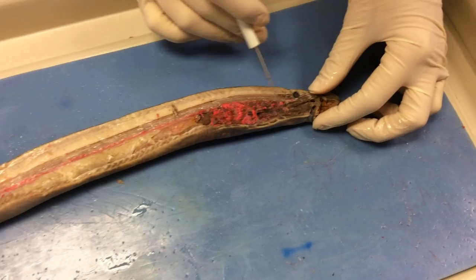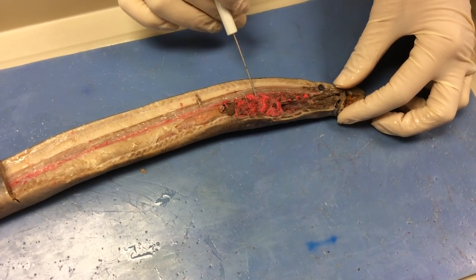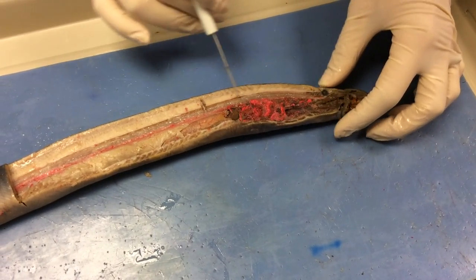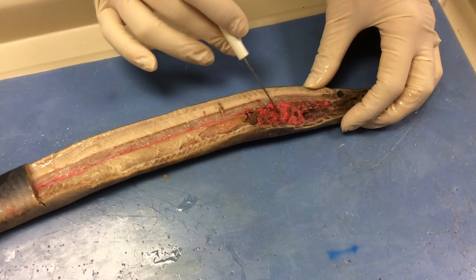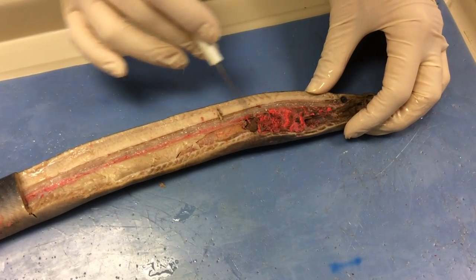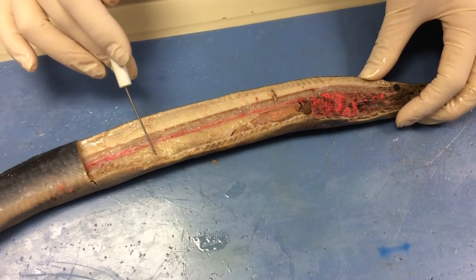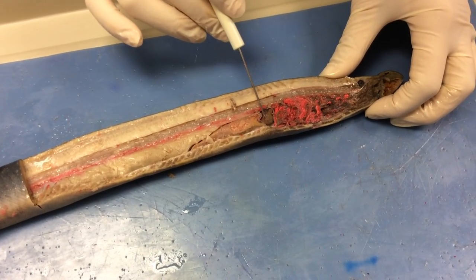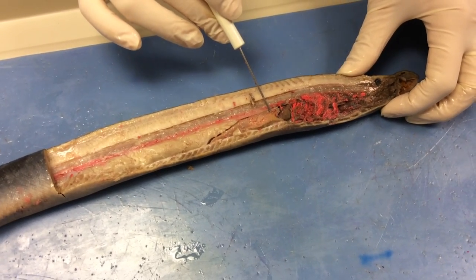The esophagus is going to travel underneath the gills in this region right here where the red is are the gills. They've all been dyed so that you have the ability to see more clearly the circulatory system. The esophagus is going to run into the intestines, and we're going to look at that a little bit later on. That's going to run through this area. What we can see here, though, just behind the gills is going to be the heart. You can locate that. The next portion is going to be the liver, which is this region right here.